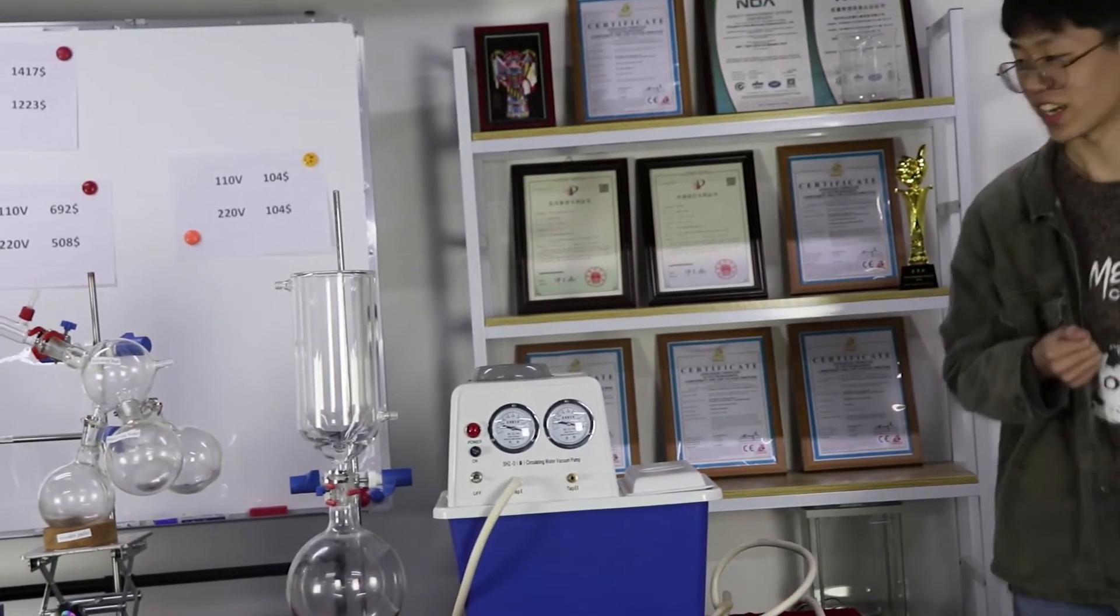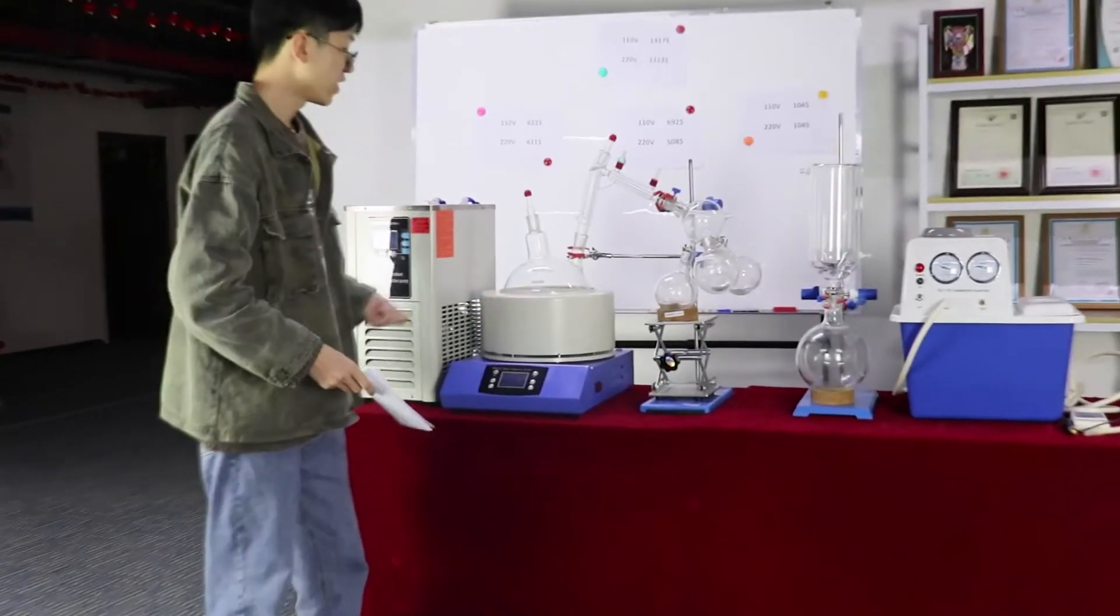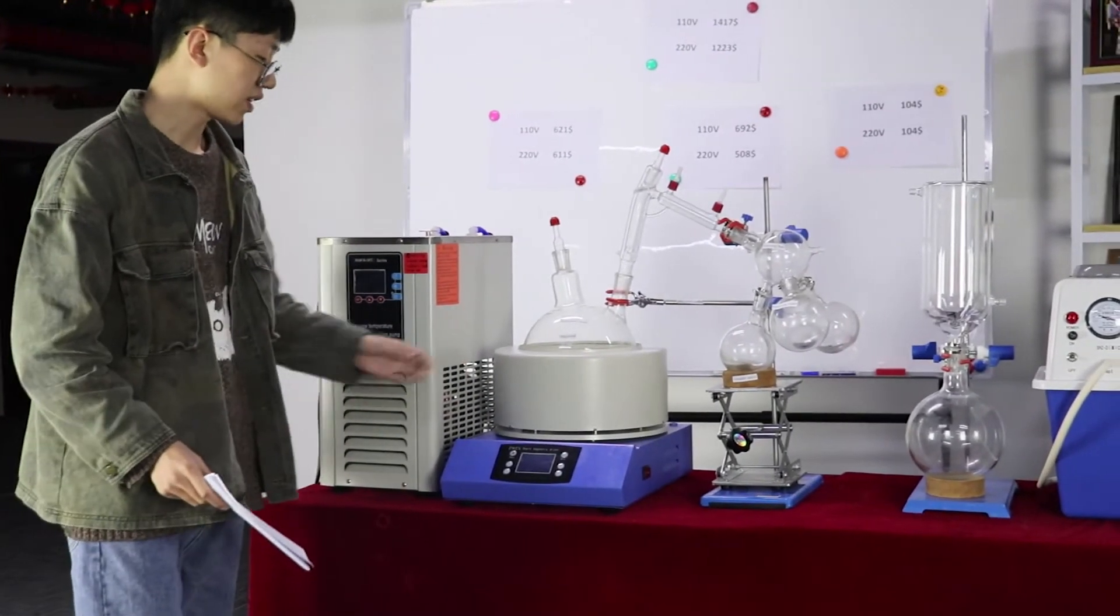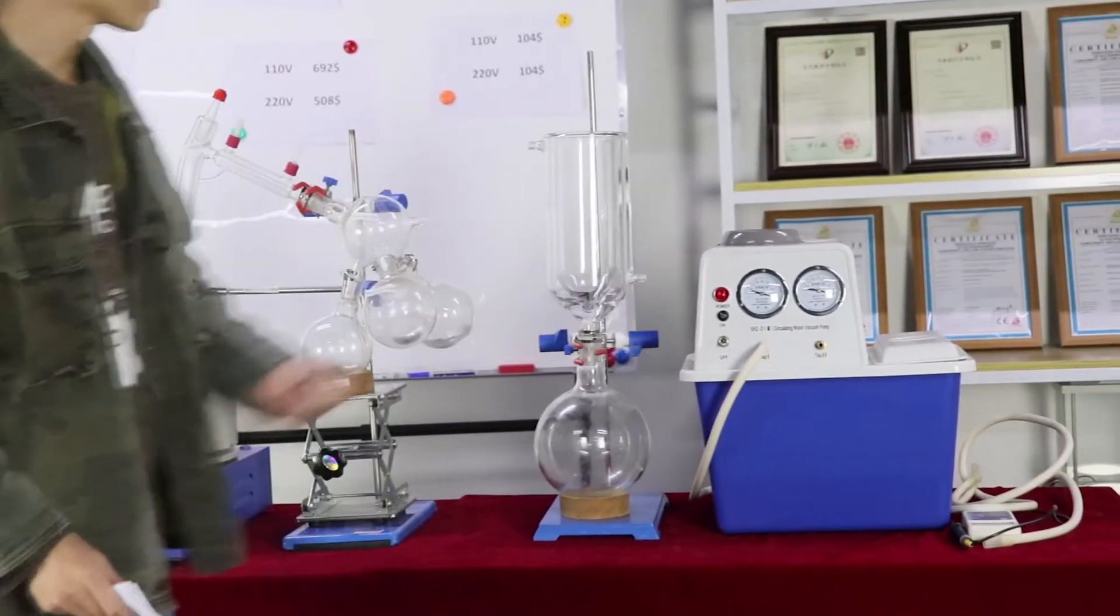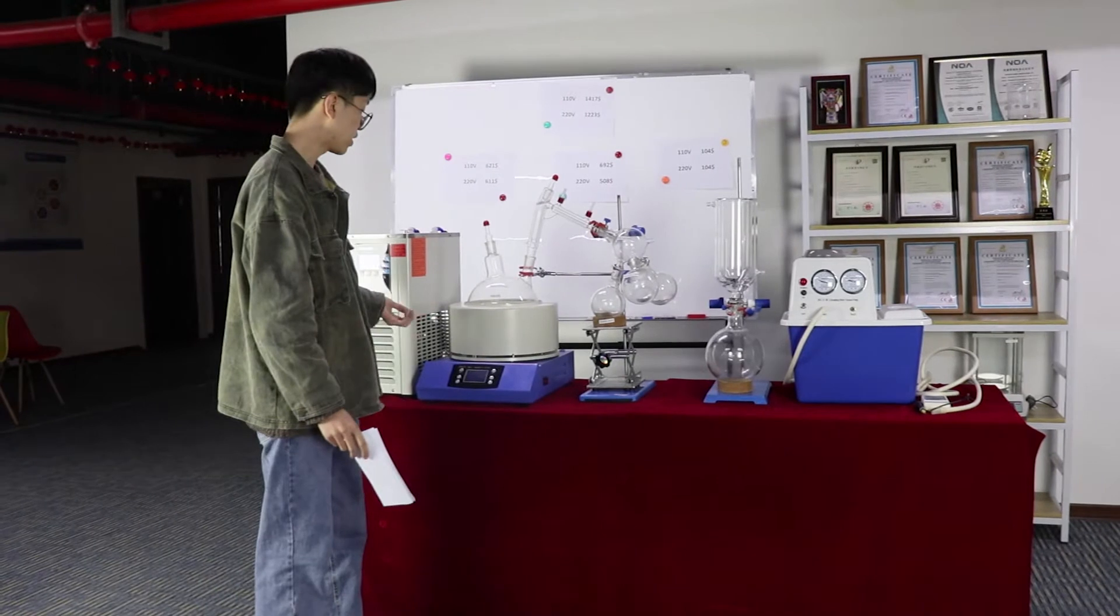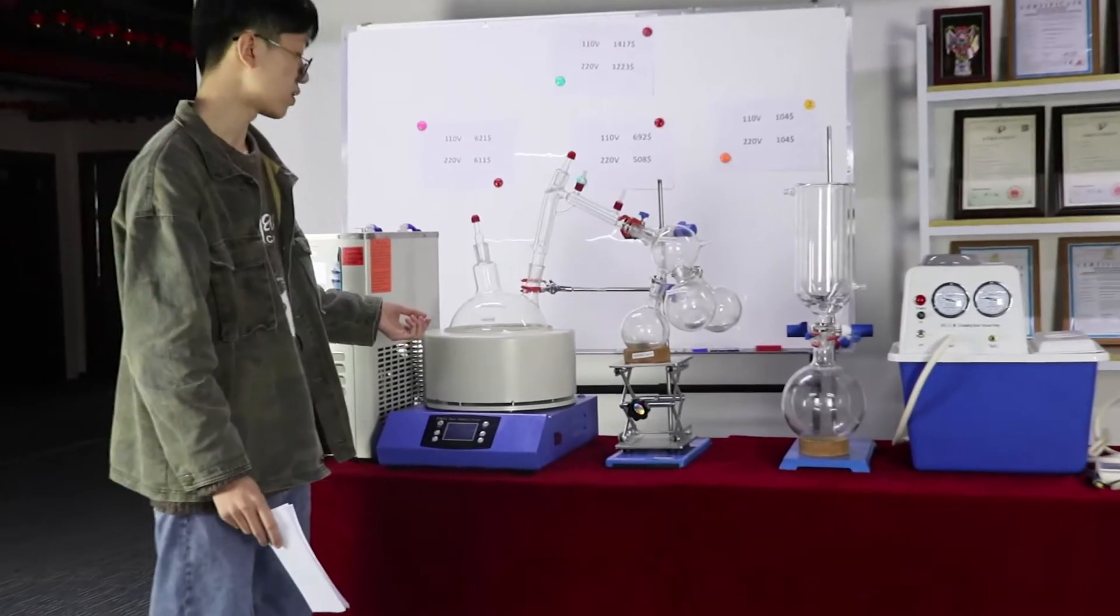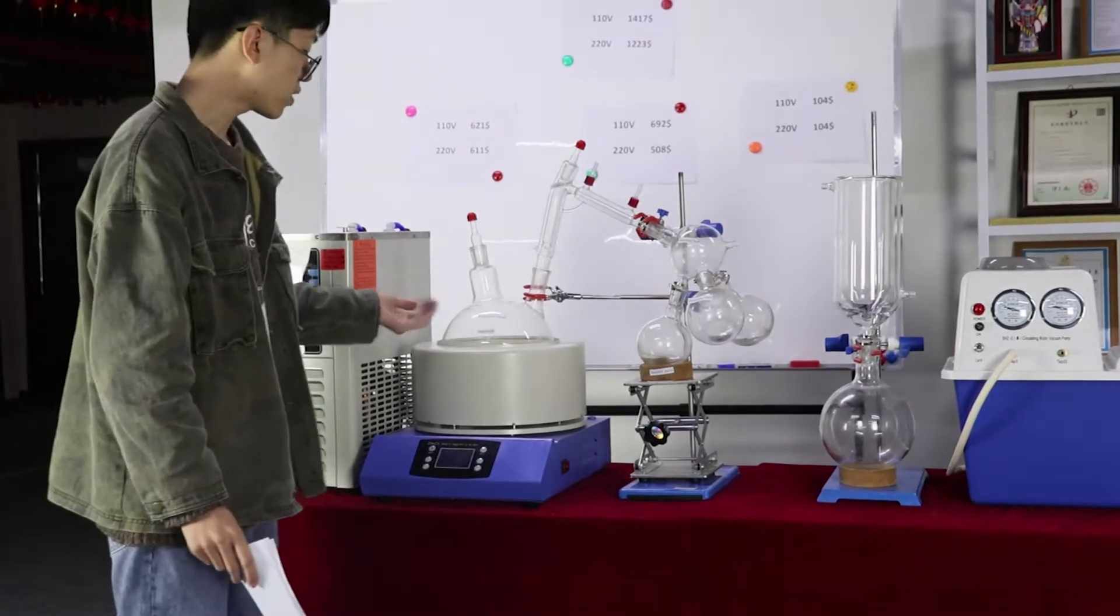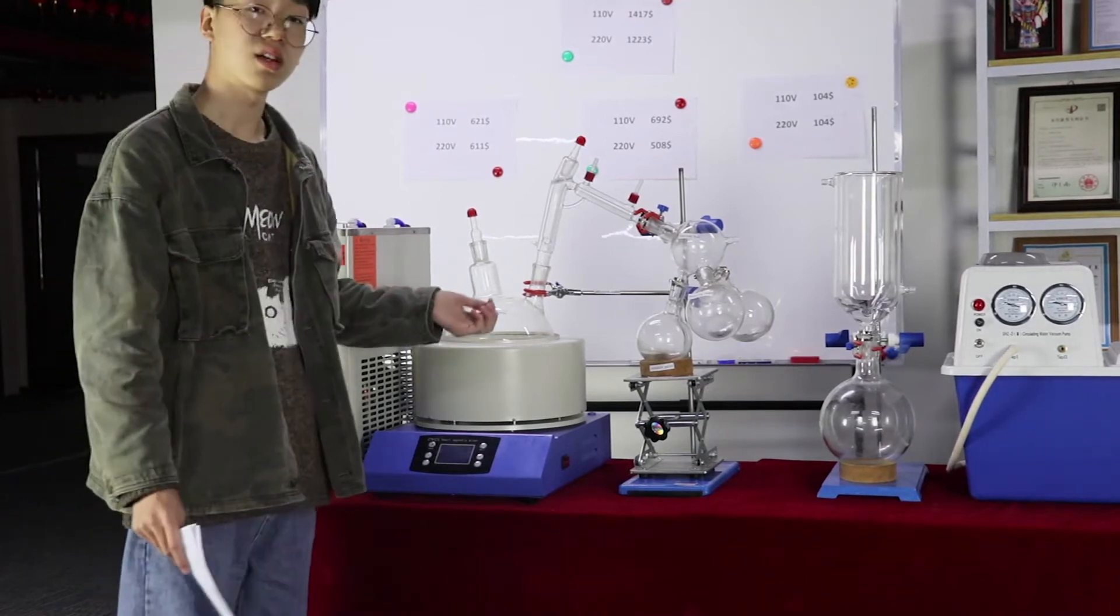Okay, as we say, this is the 5 liter short pass distillation. This is my supporting devices: heating mantle, cooling chiller, and circulating water vacuum pump. First, let me see the short pass distillation. This is my component: an evaporator bottle and magneton. The magneton is in the evaporator bottle. It can store the material.